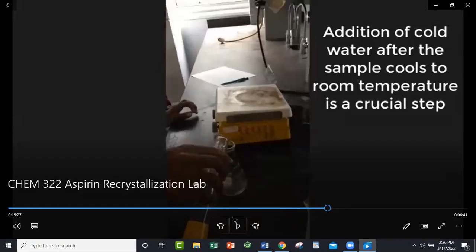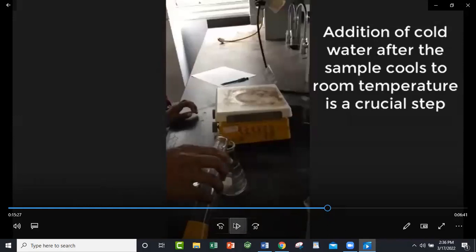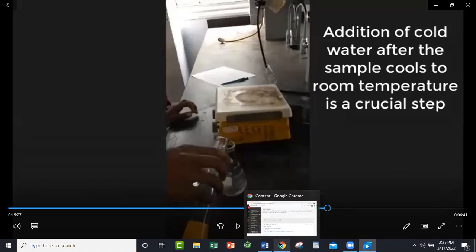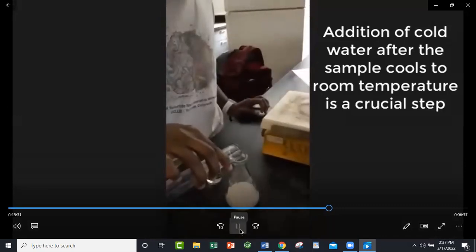And what that does is it's gonna force the aspirin out of solution, but it's gonna force it to crystallize. It's not going to cause it to precipitate, because that's different. Precipitation happens immediately. Recrystallization happens slowly. So when you add the water, as the water and ethanol begin to mix, then the aspirin becomes more and more insoluble, and that's when it comes out of solution. But if it was precipitating, it would be immediate, like all the solid would come out all at the same time right away, and that's not what happens. But this is a crucial step, because that helps to force the aspirin out of solution. And you see it turn milky, right?